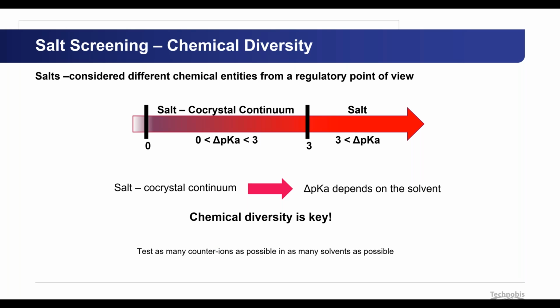Other things that you could do with the Crystal16 in terms of solid state screening. As I mentioned in the beginning when I started this presentation, when the free molecule is not an option, we would look into salts, on how to make salts that would have a higher or better physicochemical properties than the initial molecule. I do not get into details.